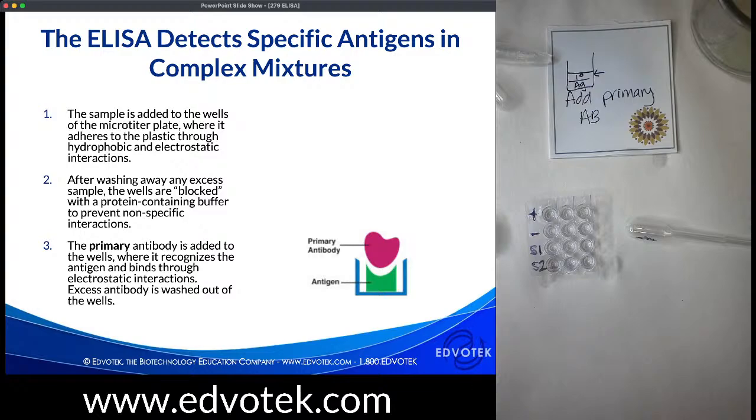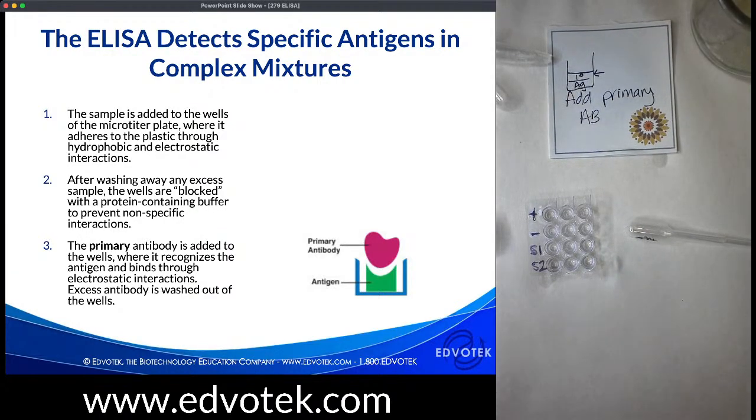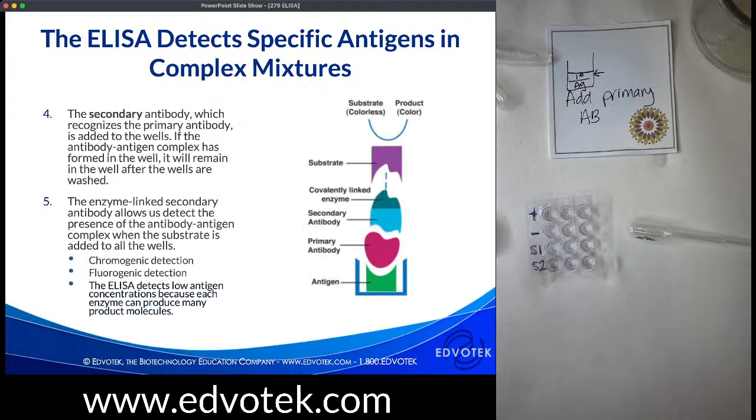And then in our ELISA, as I mentioned before, we're using a whey protein as our antigen, and we're using an anti-whey antibody. So in this ELISA, our antibodies come from an animal that has been introduced to the whey protein, created antibodies to whey, and now that interaction is happening in our tubes. The next step would be, after washing, we're going to have washing between most of these steps to make sure that there's nothing extra hanging out.